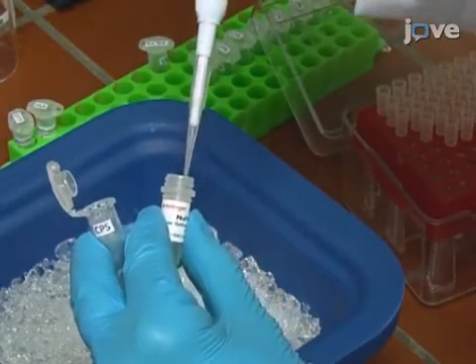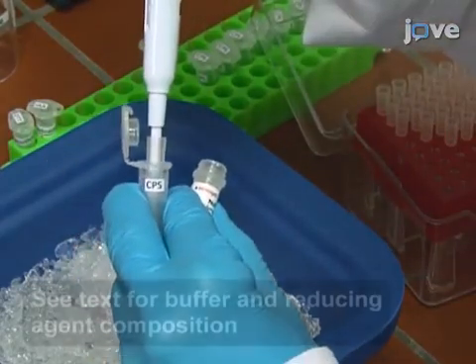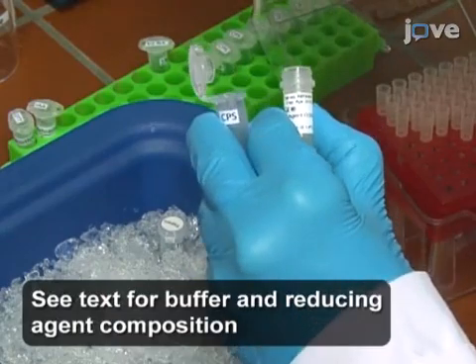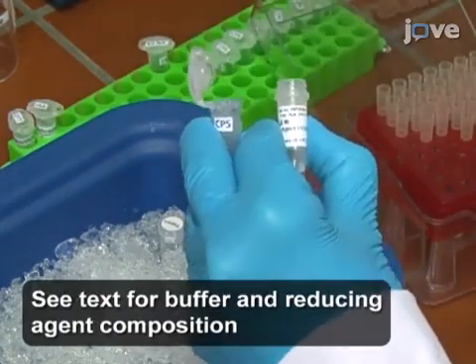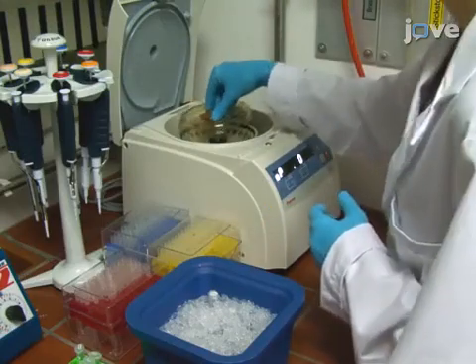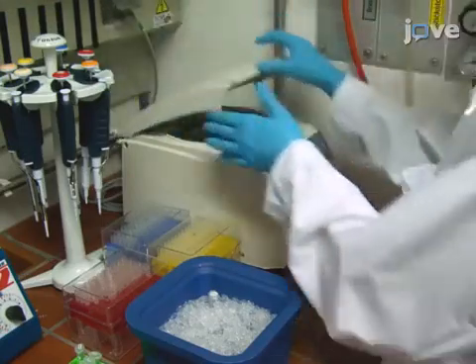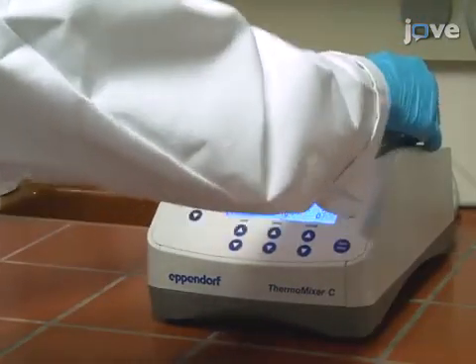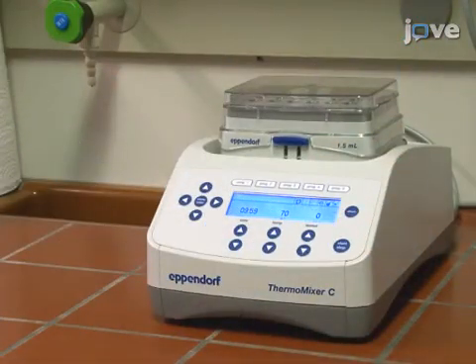First, apply 7.5 microliters of 4-fold sample buffer and 3 microliters of 10-fold reducing agent to the desired protein complex. Spin down the sample for 1 minute at 16,200 times the gravity. After centrifugation, heat the sample for 10 minutes at 70 degrees Celsius.